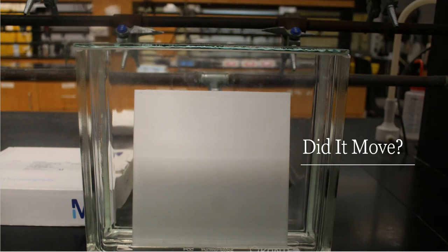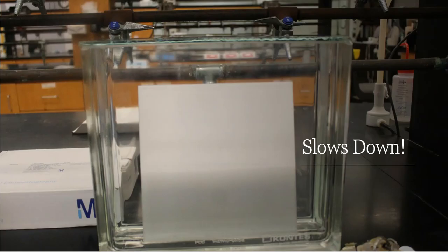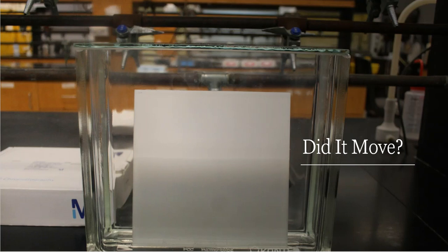Right? Okay, so from 1:44 here all the way to 2 o'clock, which is here, that's how far it moved up that plate. I told you, didn't I? I told you that this separation was going to take about an hour to an hour and a half. In the beginning, it misleads people. But the longer it stays in there, the higher it travels, the slower it goes.